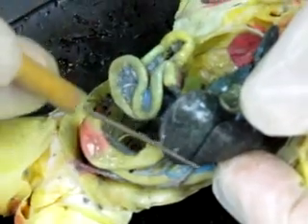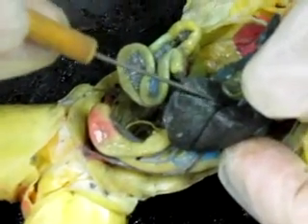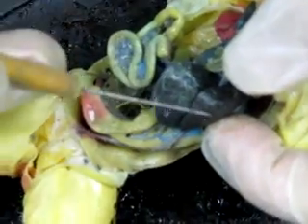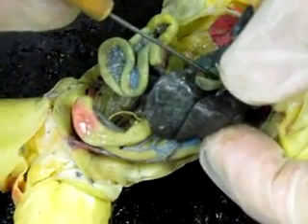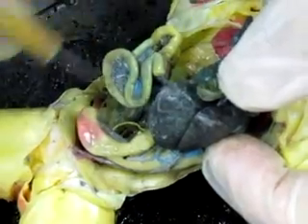It lies in between the left and right lobe and the median lobe here. You'll find that little gallbladder. The liver will produce the bile. This gallbladder will store it. Okay? That's the 3 lobes and the gallbladder.